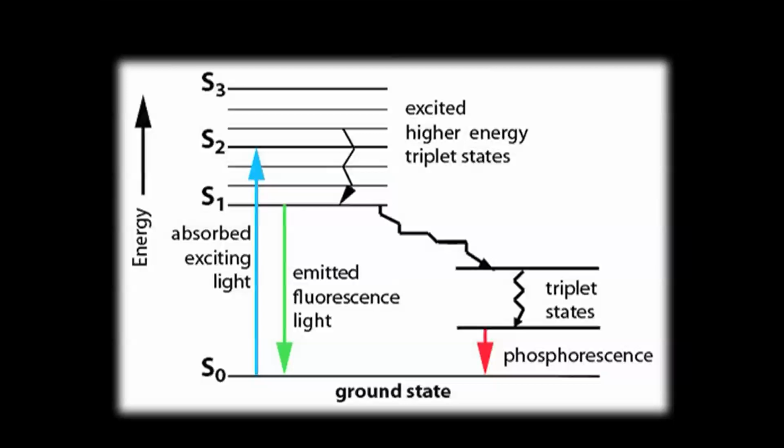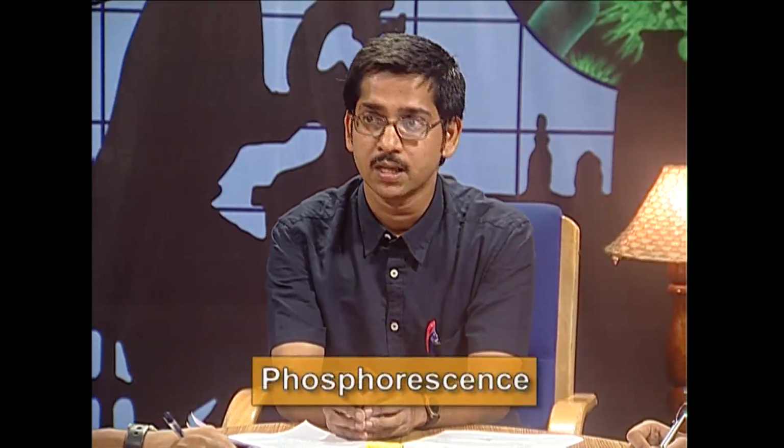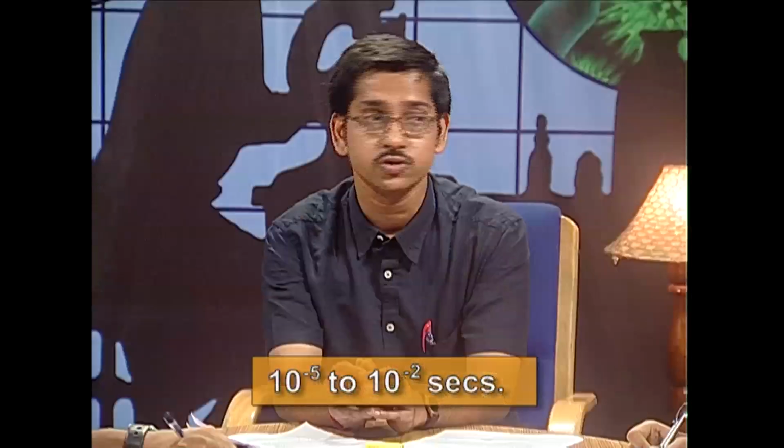Now, along with fluorescence, there is another phenomenon which can happen to certain molecules. After the absorption, the electron goes to its excited state. Then rather than coming to the ground state, it can hover into a triplet or a metastable state. It can stay there for some time and then come down to its ground state, releasing the energy in the form of a photon, but that phenomenon is known as phosphorescence. Now, the time span for phosphorescence can vary from 10 to the power minus 5 seconds to 10 to the power minus 2 seconds.